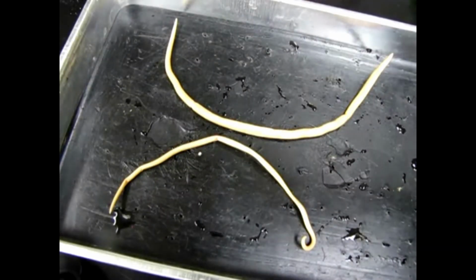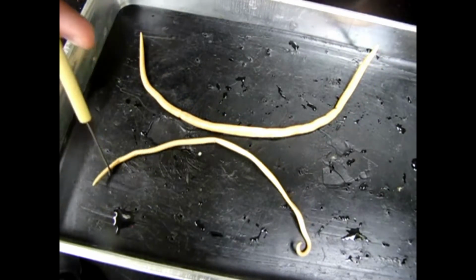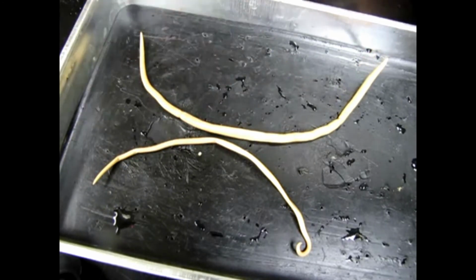So these animals that you're seeing here are roundworms. They're intestinal roundworms, so they are parasitic animals. They're in the phylum Nematoda. And the two individuals I have here look a little bit different. It's not because they're different species, it's because one is a male and one is a female.